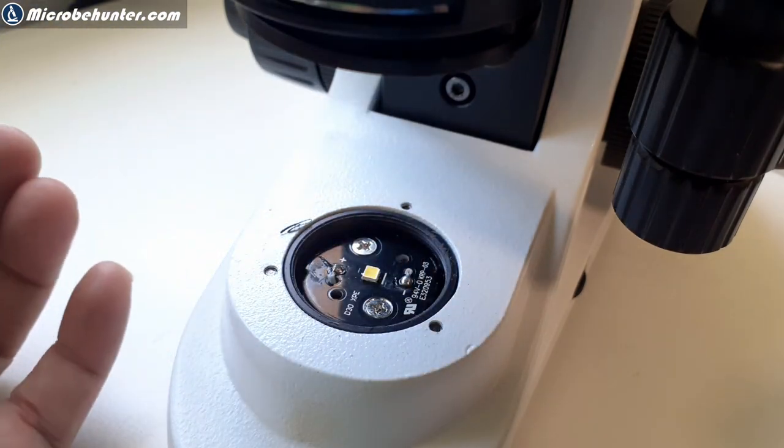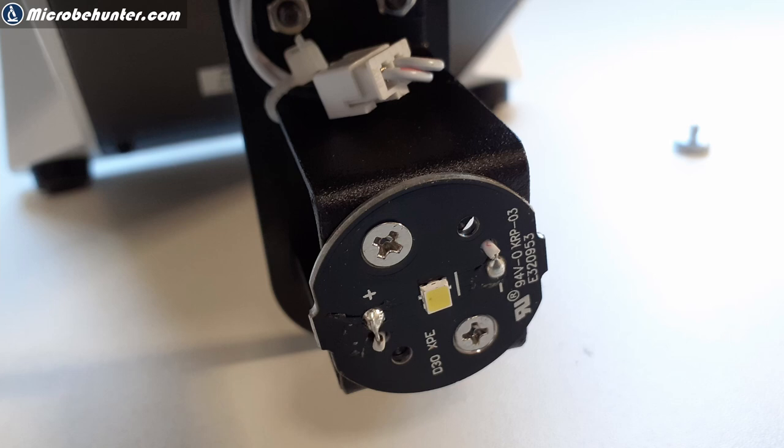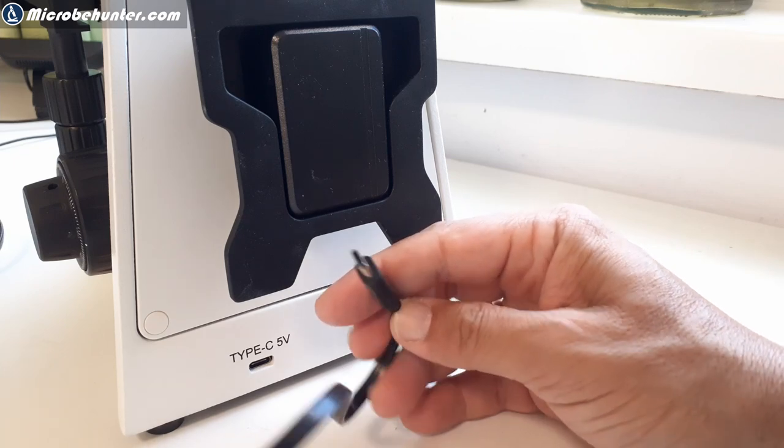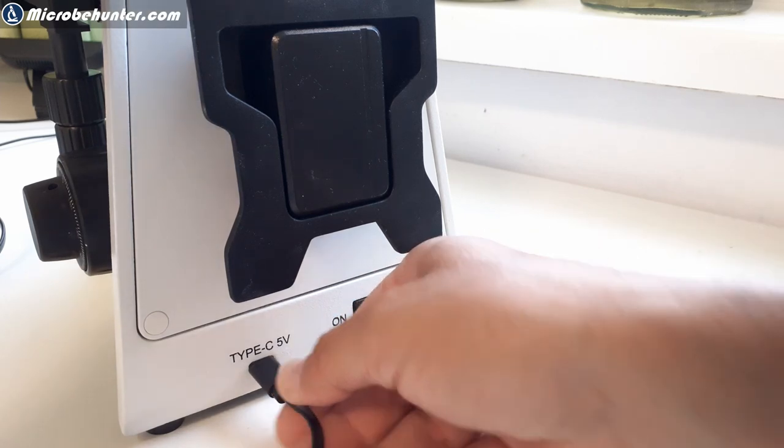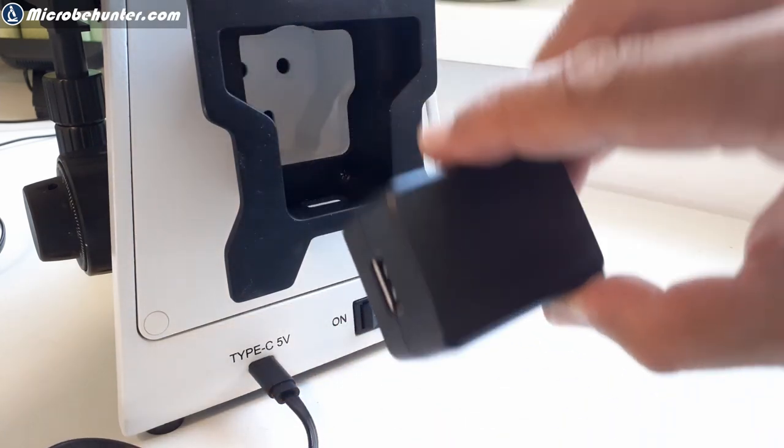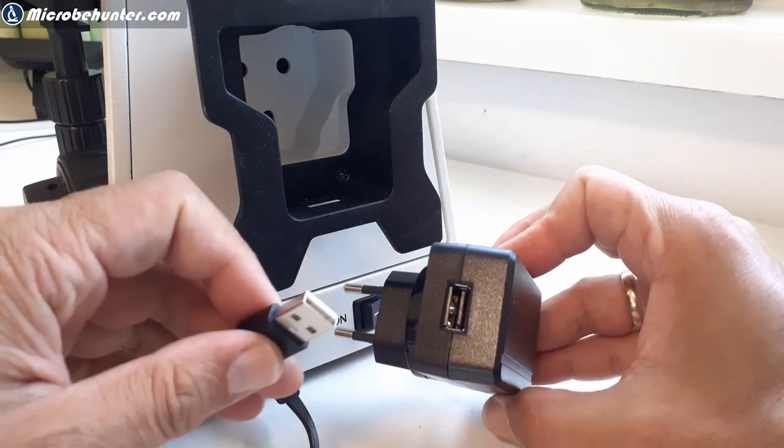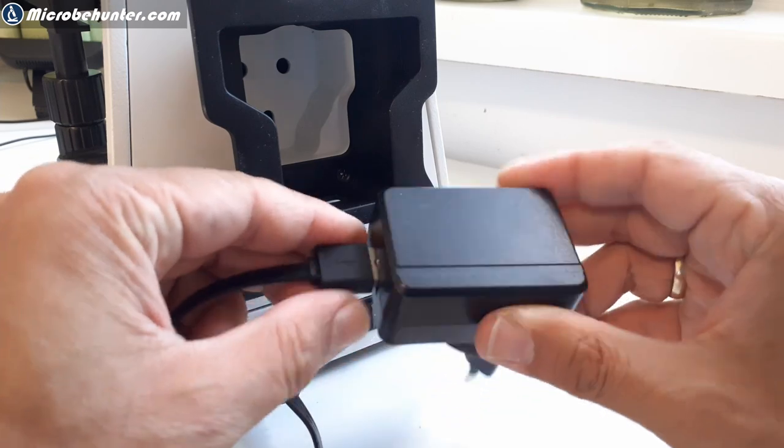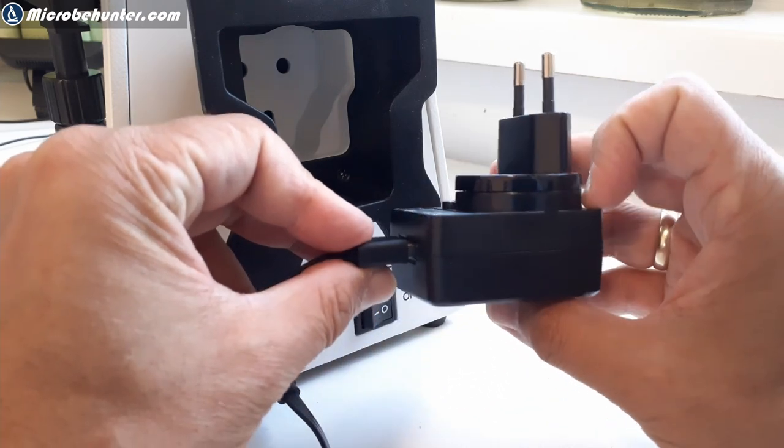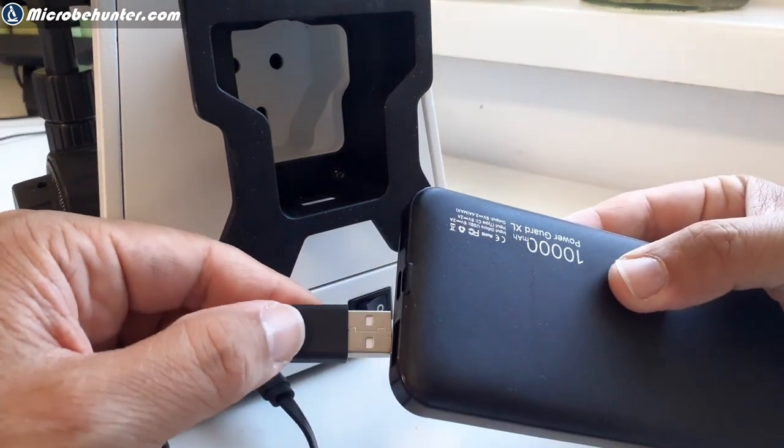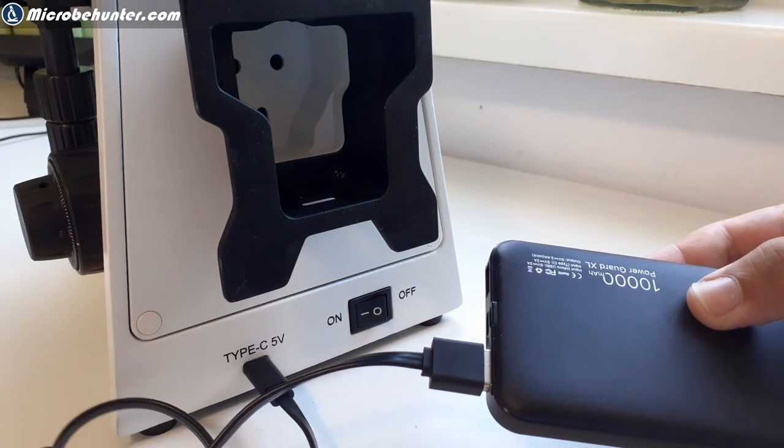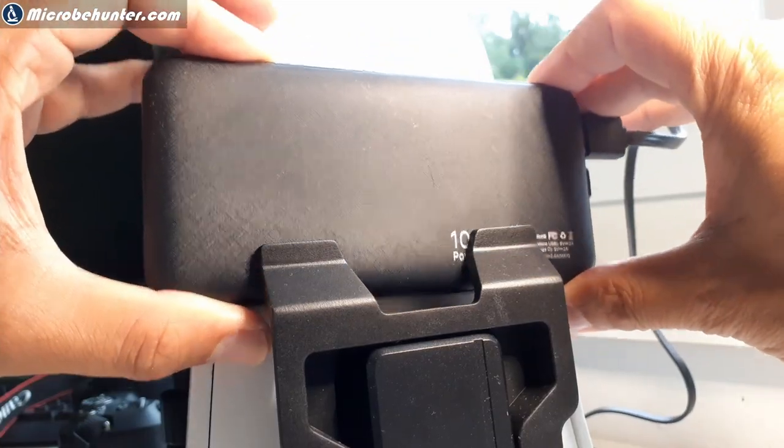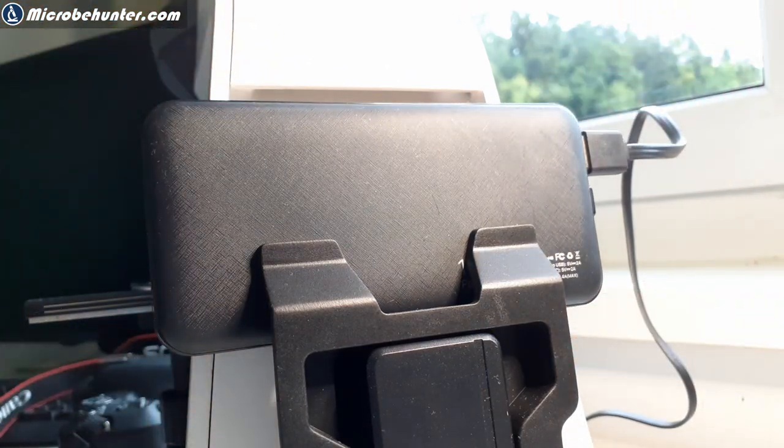But this here is now getting interesting. Look, this here is the LED. And on the bottom of the microscope, it can be popped out and it can be connected even without soldering. So that's quite something interesting here as well. That is the power supply now with a USB. And here, this is the power supply adapter, which can also be stored in the background of the microscope. And then it's a five volt power supply and then you just plug it in and then you can just use the microscope. Or you can use a power supply battery. The battery is not included, but essentially all provisions have been made because you can also pop in the battery here on the back of the microscope as well.